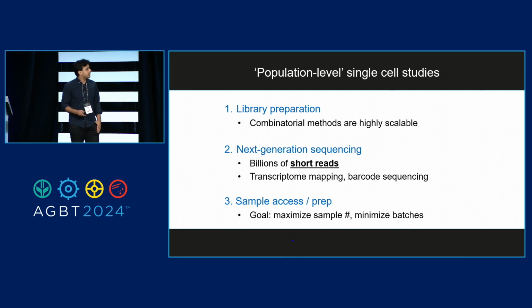There are three. Of course, library preparation. We need to prepare libraries for millions of cells, and new technologies that enable, for example, combinatorial indexing, or you heard some work previously from Fluent, are causing those costs to drop very quickly, and that's very exciting. We still do need to be able to sequence all of those libraries, and of course that's why we're here today, to talk about the ability to get billions of reads. They don't need to be very long. We don't need 500 base reads.